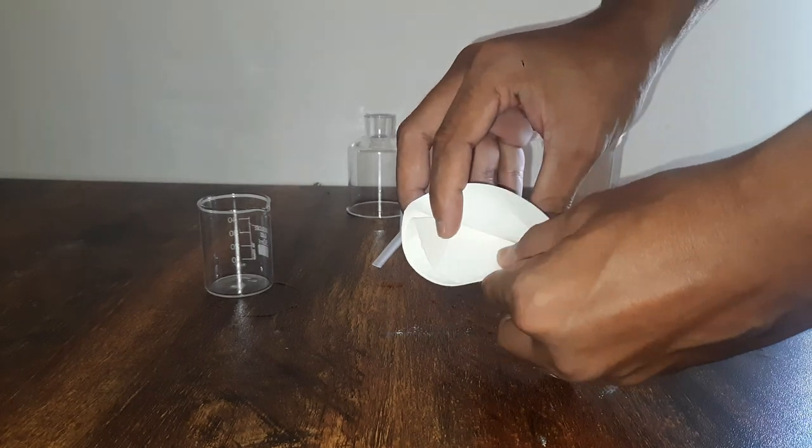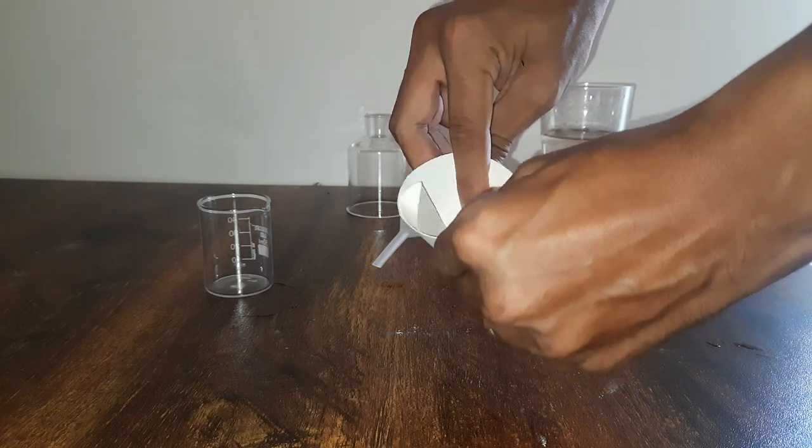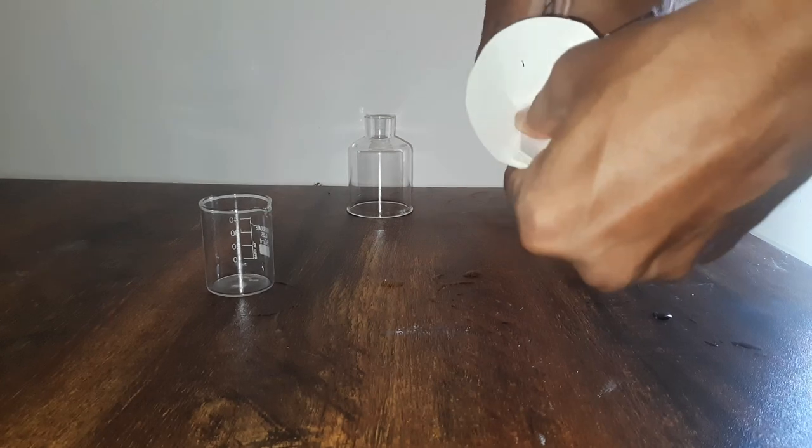So that a cone is formed, kind of like this. And then we can try and stretch it somewhat like this. Next, we try to fit this into the mouth of the funnel.